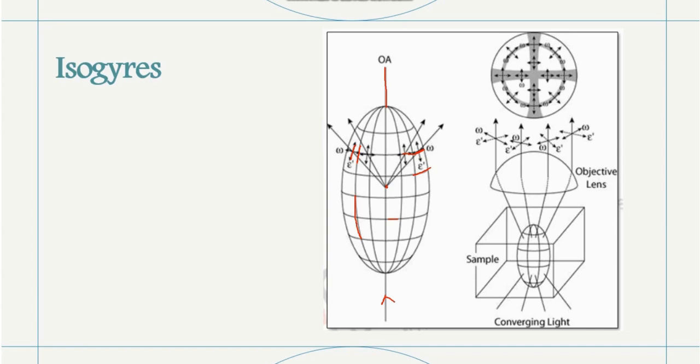All right. So the extraordinary rays vibrate along radial lines symmetrical about the melatope, and by so doing, the ordinary rays in turn vibrate tangent to the circular isochromes. They vibrate parallel to the tangent to the circular isochromes.